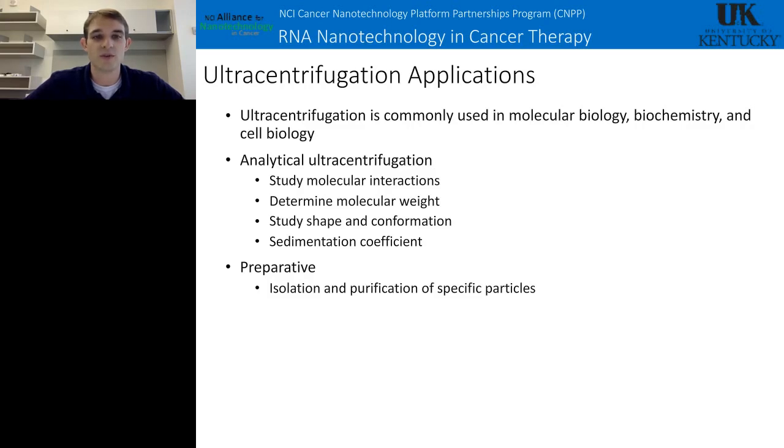Analytical ultracentrifugation is used mainly to actually study your molecule, whether that be molecular interactions such as RNA-protein interactions. You can also study the physical properties of the particle, such as molecular weight, its shape and conformation. Using all this, you can determine its sedimentation coefficient, which also relates to the molecular weight and its shape and conformation. But the ultracentrifugation method I will be focusing on in this webinar today is preparative ultracentrifugation, mainly isolating and purifying specific particles. In this case, that particle will be RNA.